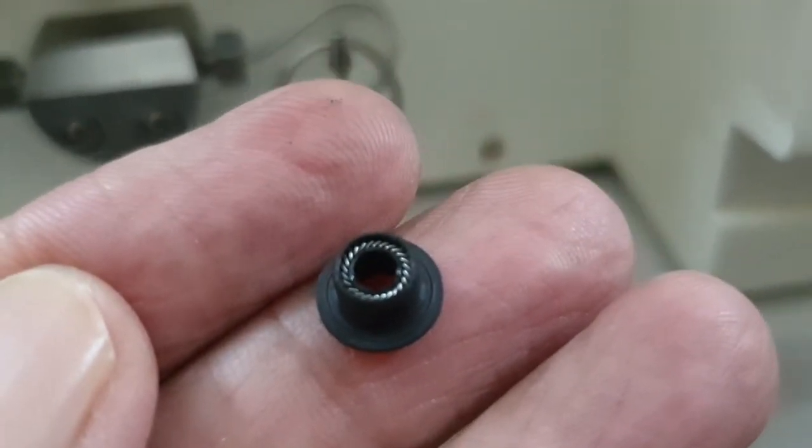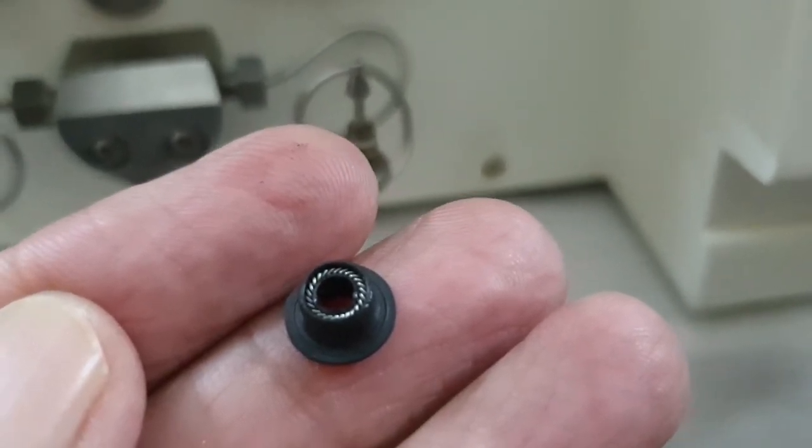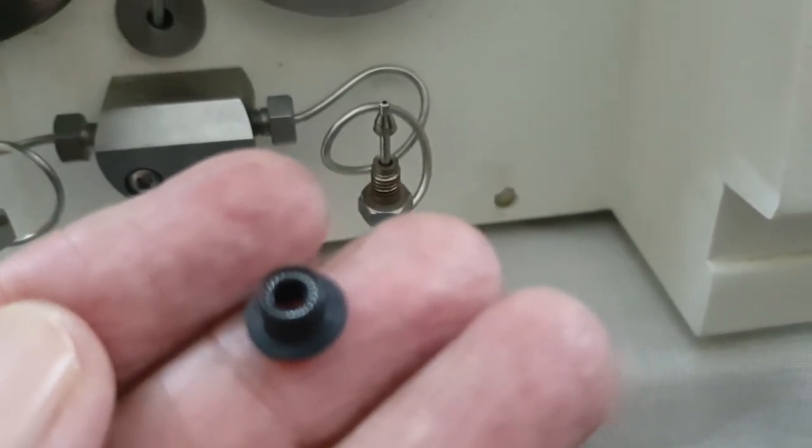The plunger seal is damaged and we will replace it with a new one. This problem of leakage will then be resolved. The seal is damaged from wear.